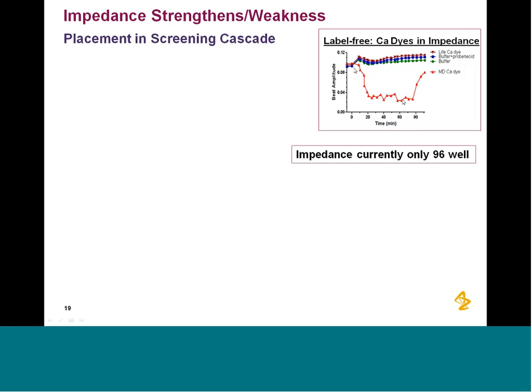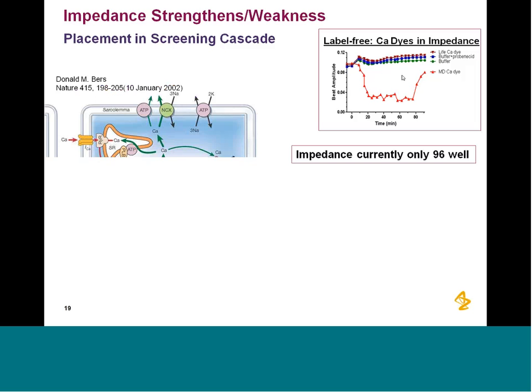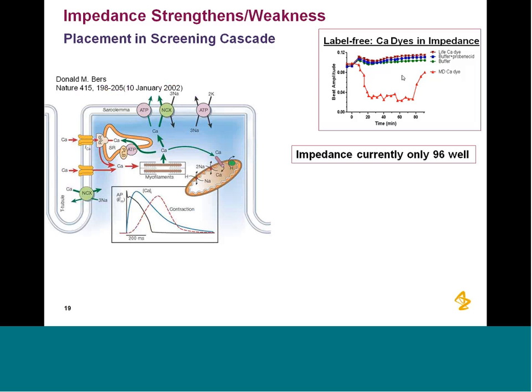And here I've tested a couple in the xCELLigence assay, where you can see the effect of the dye itself, and you can see that some have it and some don't. You could probably manage this, but I'm not sure that's where you want to be, at least for a frontline screen.